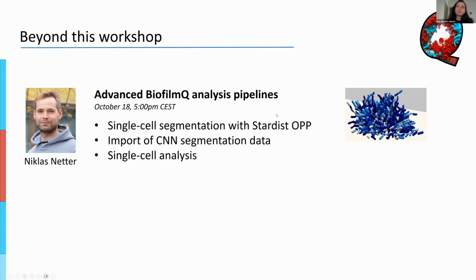It's an optimized version of StarDist, but you can use any other segmentation or any other neural network. And he's going to then show you how you can import this segmentation data and do single cell analysis on that segmentation data. This is one of the features that has been added in the new major update that we have done to BiofilmQ in the last 2 weeks.